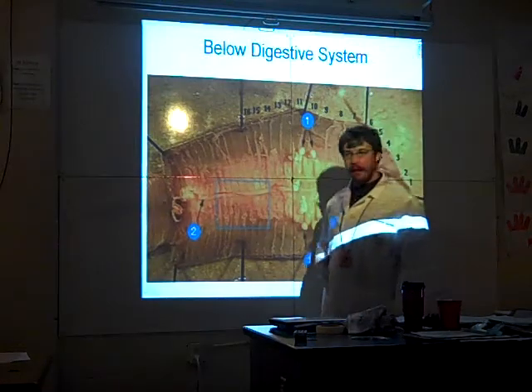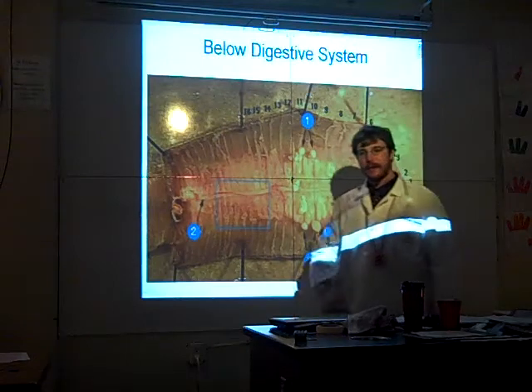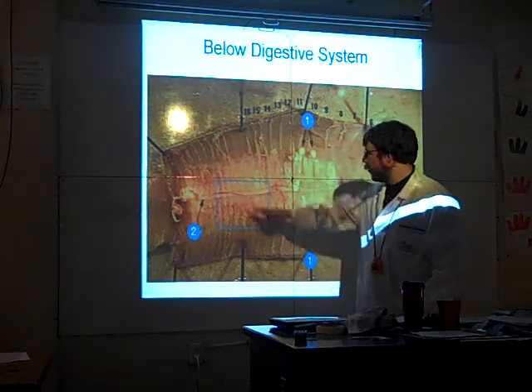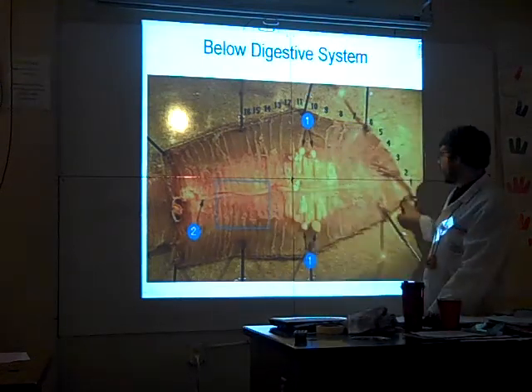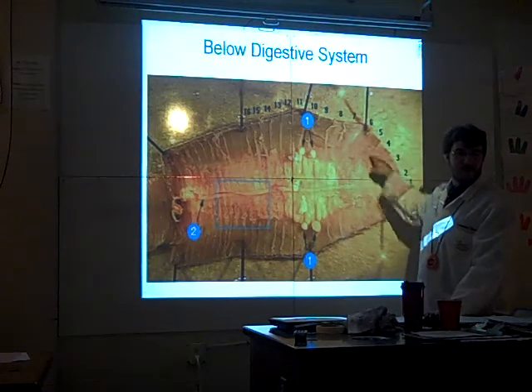See this white line on the bottom? That's its belly. It's got a ventral nerve cord. Your nerve cord's dorsal. Everybody else except phylum Chordata, it's ventral. And you might even see the ventral blood vessel. And maybe even, there's little white dots here. Those are its brains.